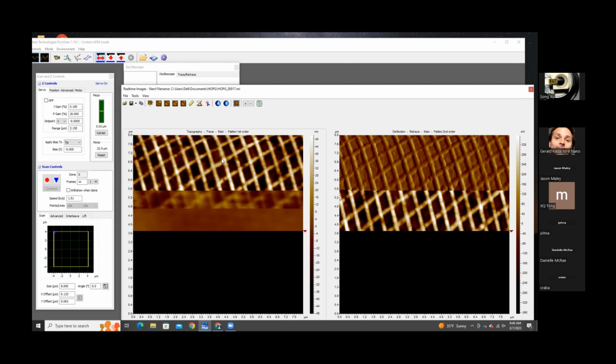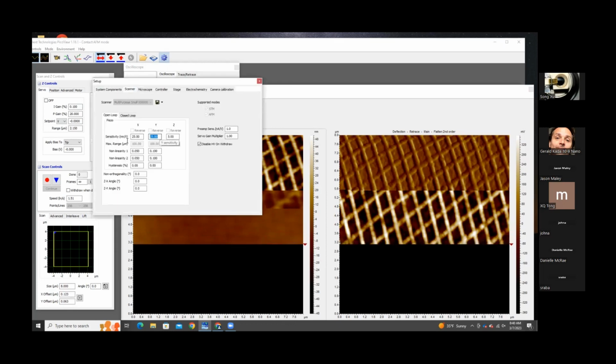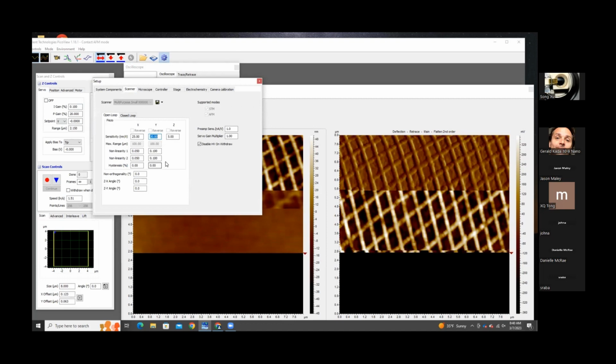This scan is not calibrated, so the image looks elongated, and then you can read these numbers and change your calibration. Calibration is right here, under Scanner, and you change this number. This is obviously not calibrated. Change this number and make it different, right? Ideally, you do this carefully on a sample that is carefully turned orthogonal, and then get the correct readings.